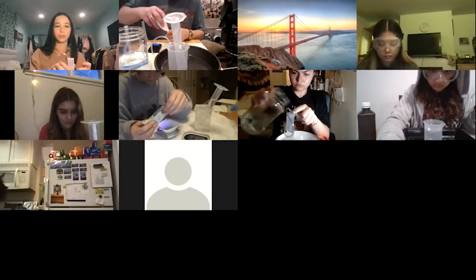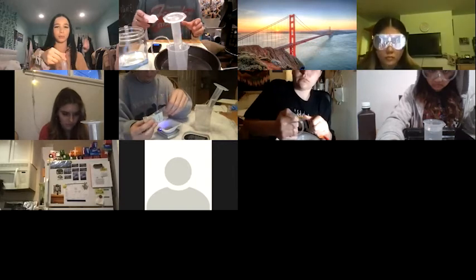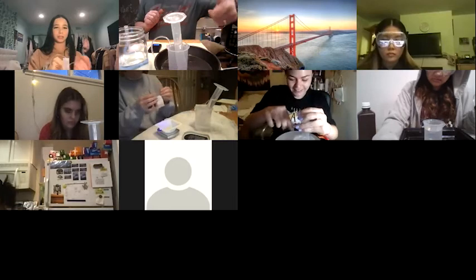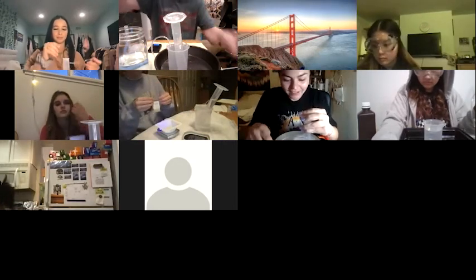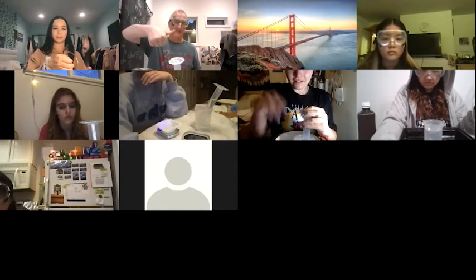So do we put the tube in this beaker and then put our thumb over it, right? Right, yes, that's the tricky part. You put the tube in it, and then you have to put your thumb over both the tube and the opening. So yeah, it's a little tricky.